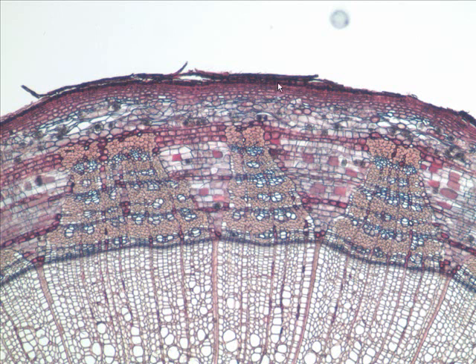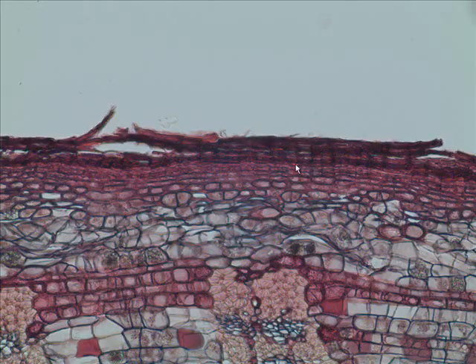We come to the top now, and we see the vascular cambium, and there's another cambium up toward the top. What cambium would that be? Here we are up close and personal, it would be what? It would be the cork cambium. Cork cambium would just really mostly be concerned with what it produces to the outside, and that is what? Cork, commonly known as bark.